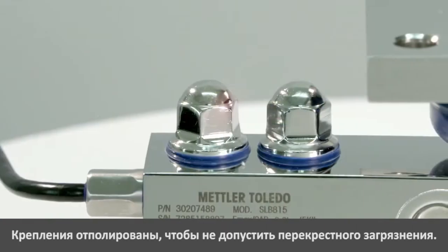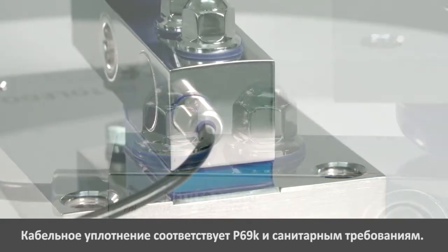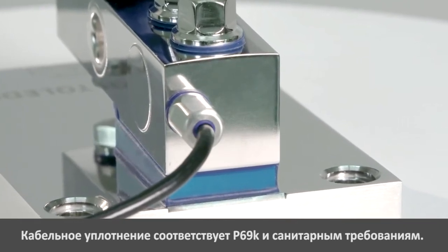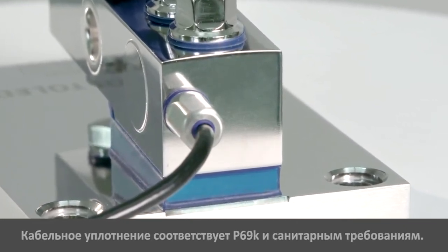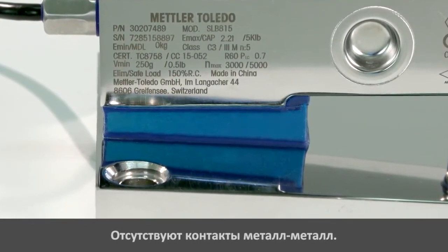All fasteners are mirror polished to avoid cross-contamination. The hygienic cable gland is IP69K protected as required for harsh environments. There are no metal-to-metal contacts to avoid micro-organism contamination.